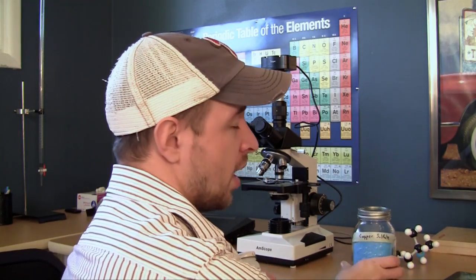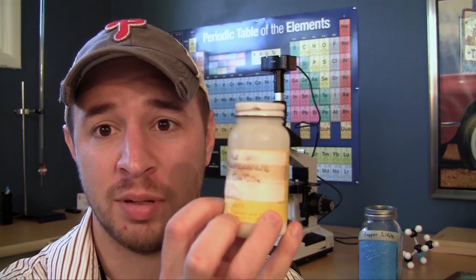And another thing is whenever you have a concentrated acid they can actually eat through certain types of plastic. So just make sure you do a quick google on the chemical and see the proper storing procedures and that's going to make sure that your chemical doesn't eat through your container.